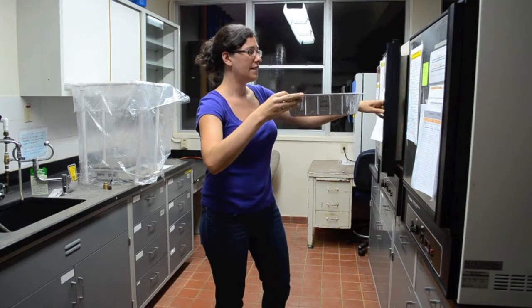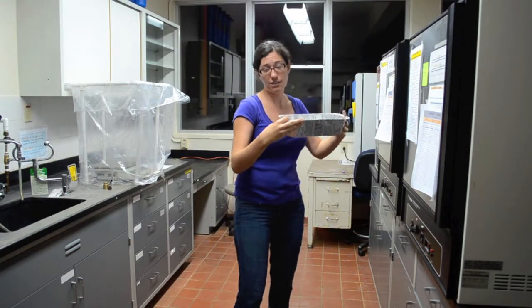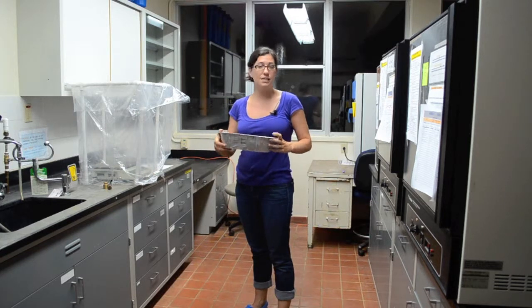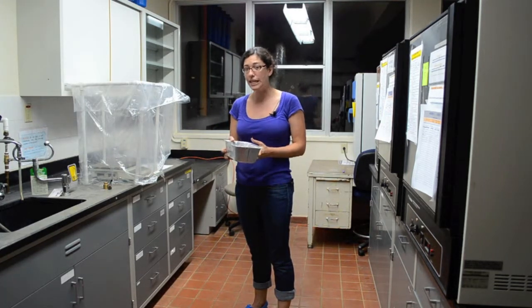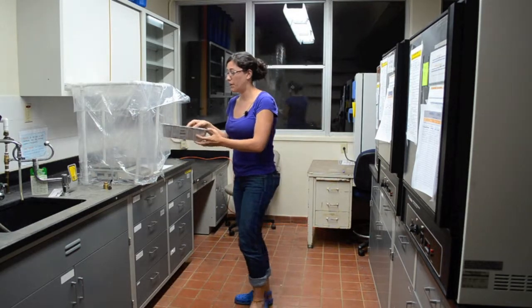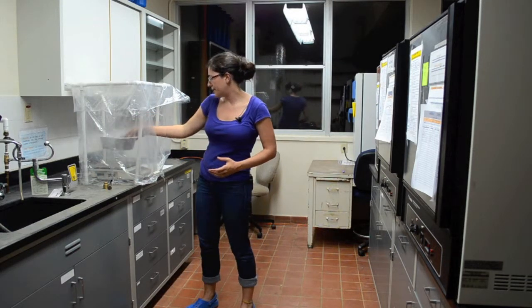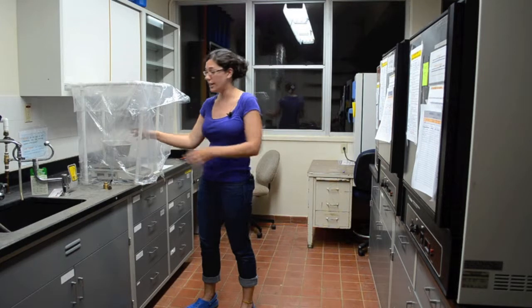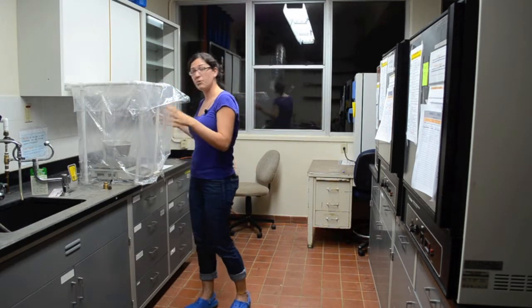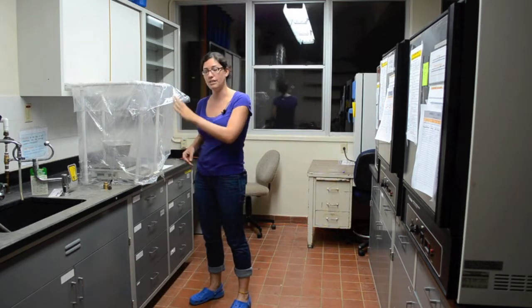We have a sample here — this is number 14-2. It was collected in the forest, it's been washed, it was in the drying cabinet for about a week, and then it came into the oven where it's already been for a couple of days. I'm going to put it on the scale, making sure the tray doesn't touch the walls. This structure is to prevent the air conditioning draft from blowing on the scale, because that could interfere with the weight reading.